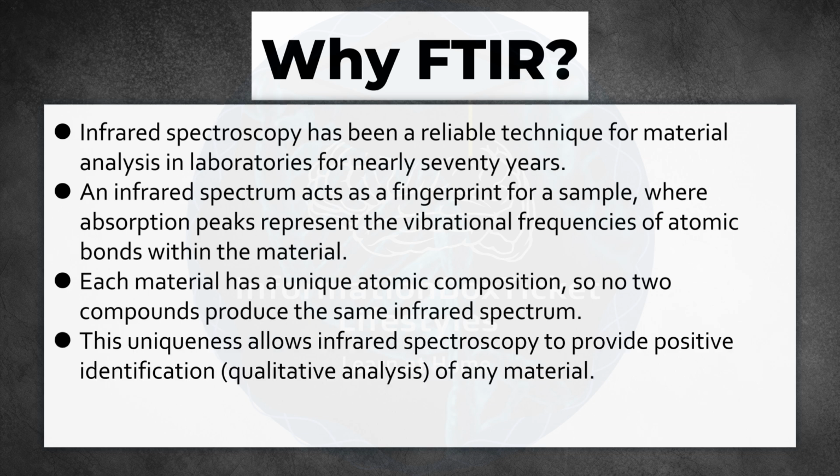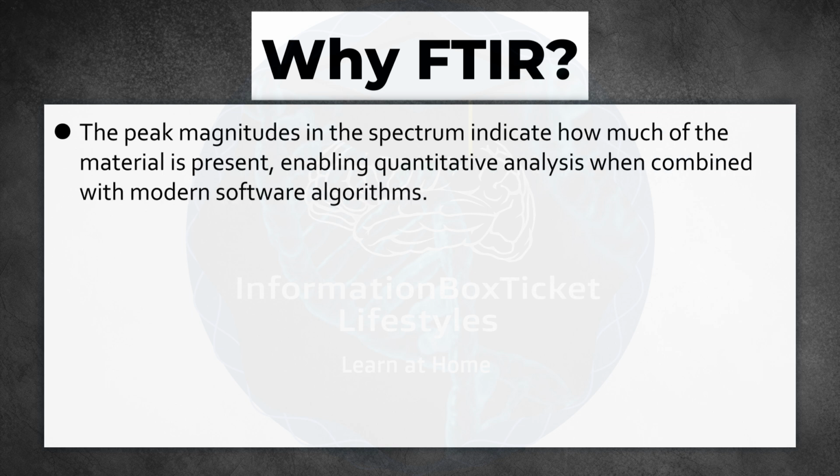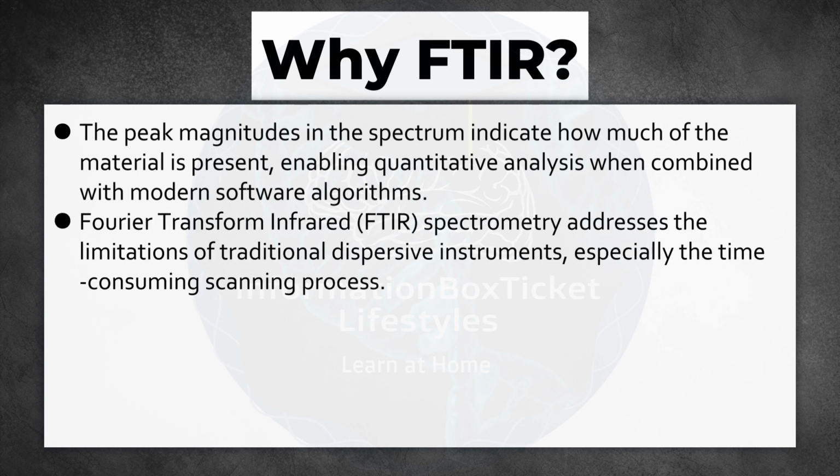This uniqueness allows infrared spectroscopy to provide positive identification, qualitative analysis, of any material. The peak magnitudes in the spectrum indicate how much of the material is present, enabling quantitative analysis when combined with modern software algorithms. Fourier Transform Infrared spectrometry addresses the limitations of traditional dispersive instruments, especially the time-consuming scanning process.